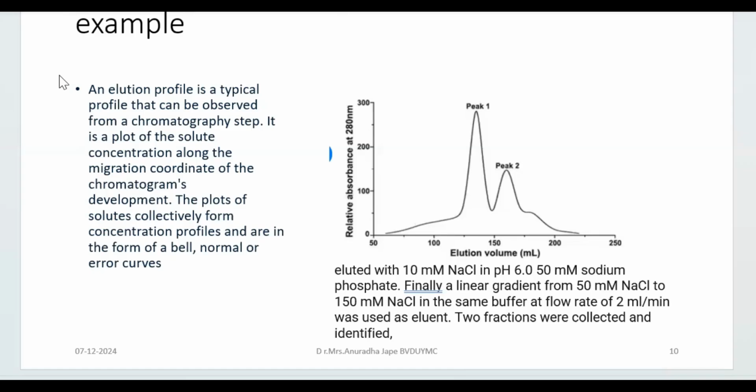So it is absorption given at a particular wavelength. For example, 200 nanometers, 300 nanometers, 280 nanometers, in this case that absorbance is checked and that will appear as a peak. So it tells us that a spectroscopic system is attached to your column chromatography, and whatever analyte is coming as part of the fraction separated appears in the volume.